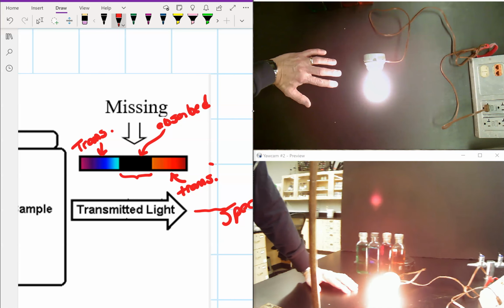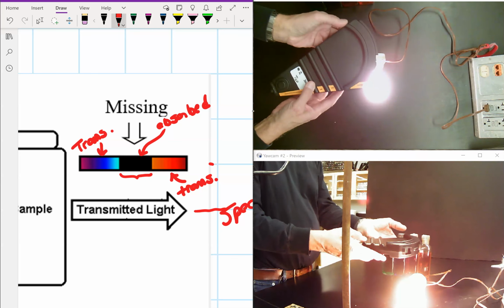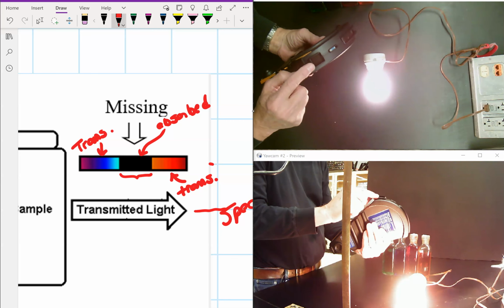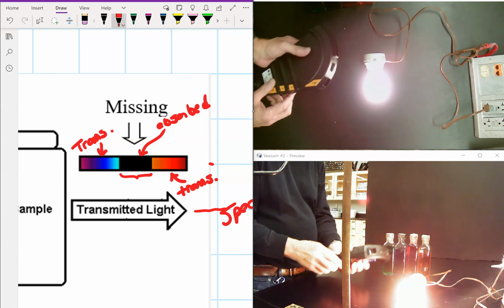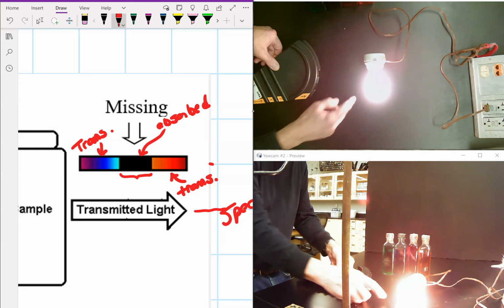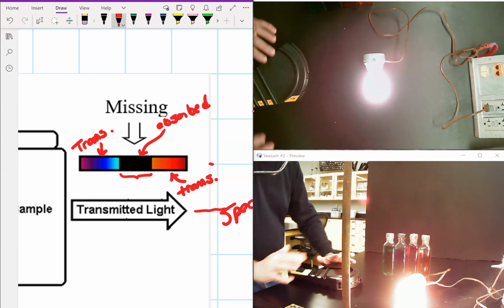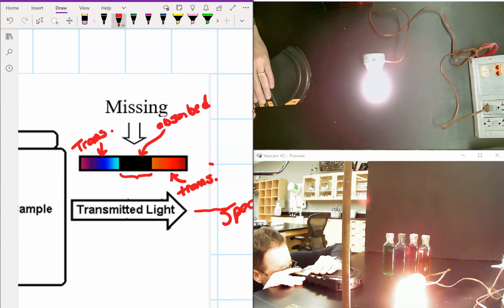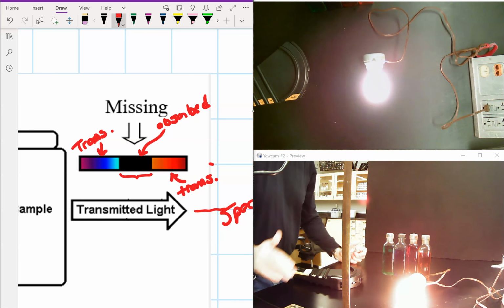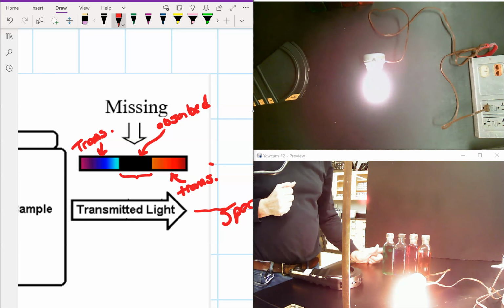Now, we'll also need a spectroscope in place, and so I have my spectroscope handy right here. Remember that the light source needs to illuminate, the light that we're going to study needs to go through the small rectangular opening here. Having the light bulb over on its side makes it possible for me to just place my spectroscope on the table. And now I can look into the spectroscope and adjust it back and forth until I see a very nice continuous visible spectrum with all of the colors of the rainbow. The alignment has now been performed.